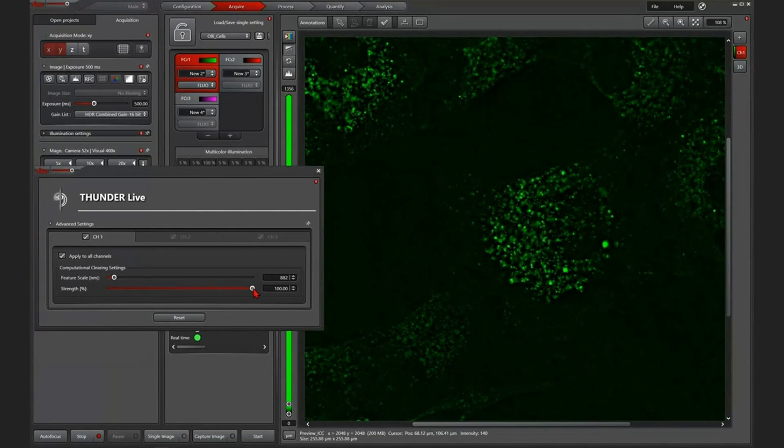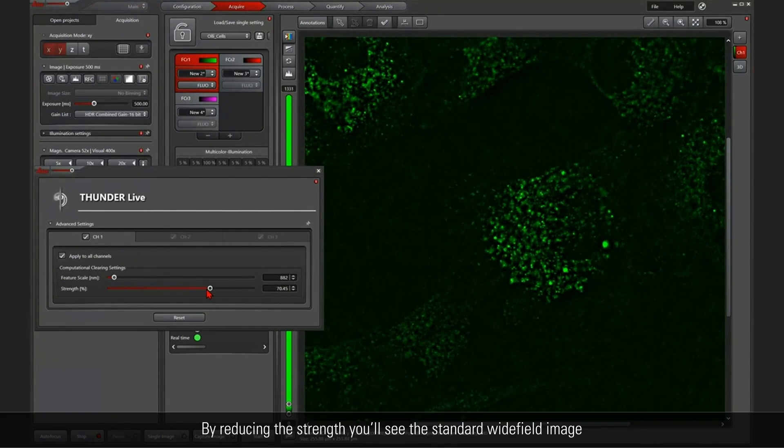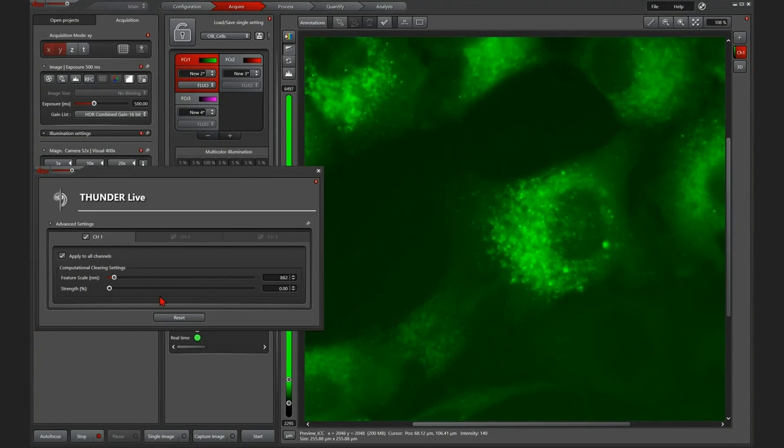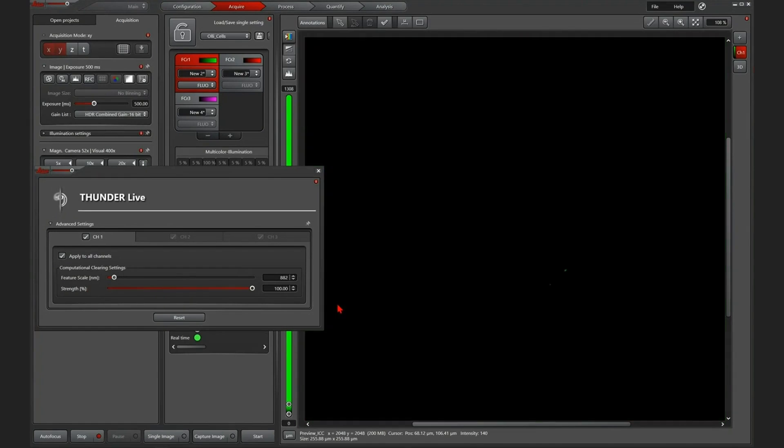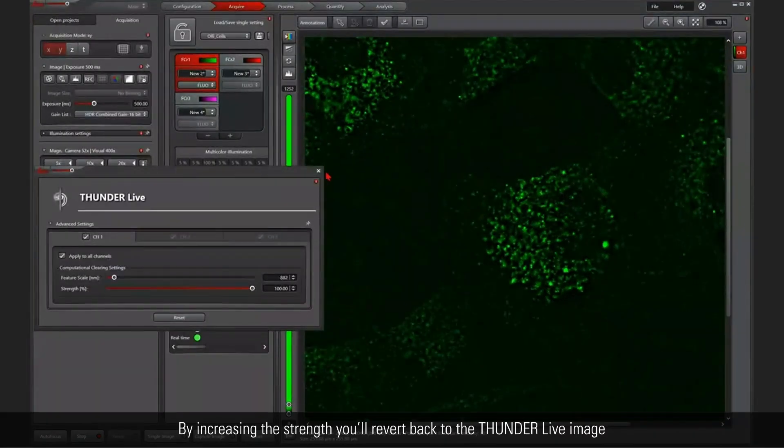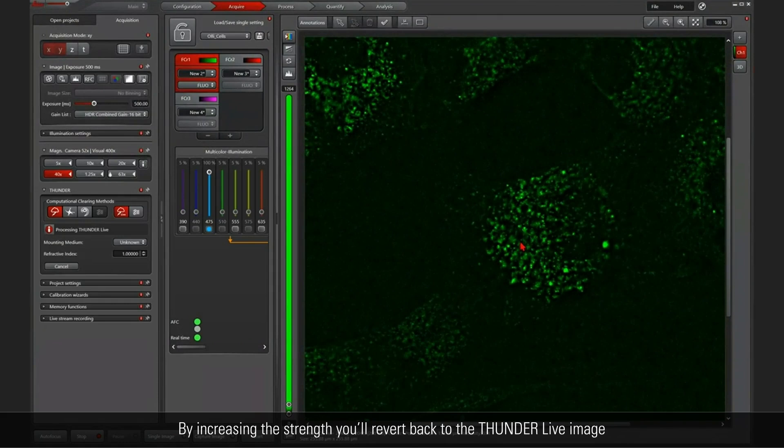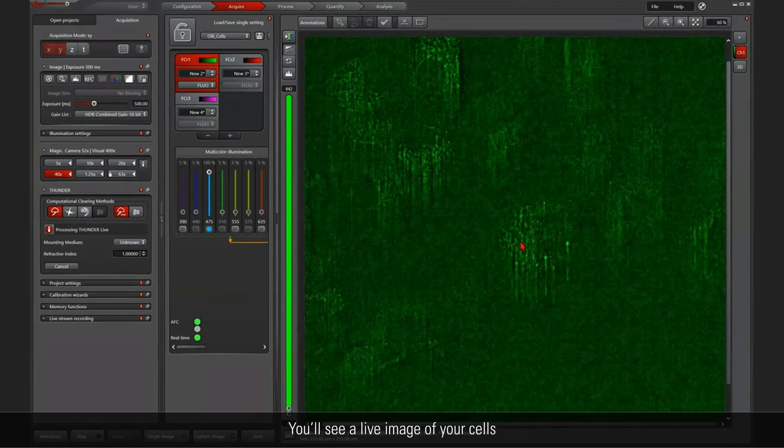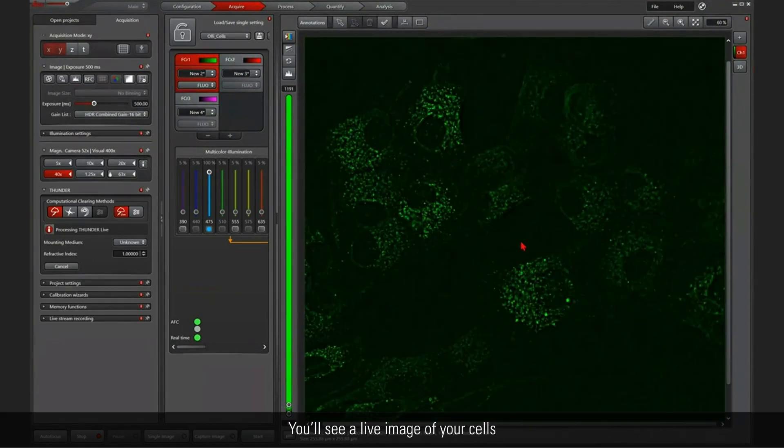Of course, I can show you when I reduce the strength again, we are back in standard wide field. And if I use the strength again, we are back in Thunder Live. So it's just a live image of your sample.